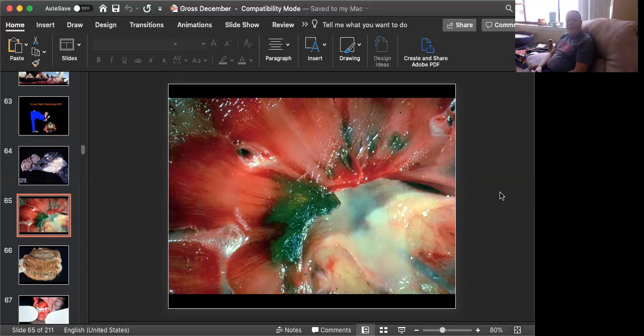And this one goes a long way back. It's a beautiful picture. It is from a horse, and I need a morphologic diagnosis and a cause on this one. Okay, time's up. We are looking at the renal pelvis, and a significant portion of it is greenish.